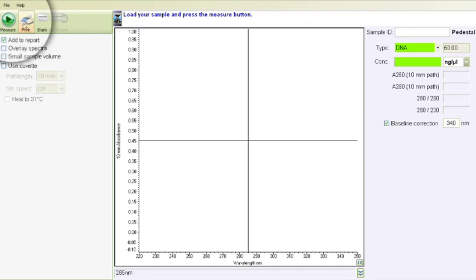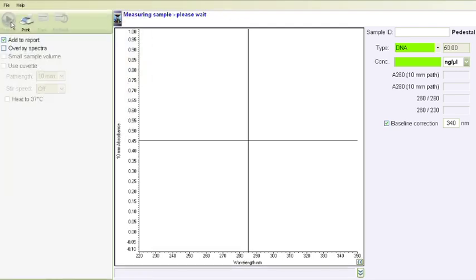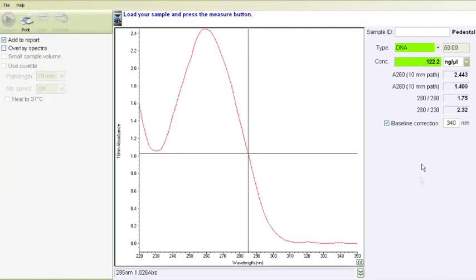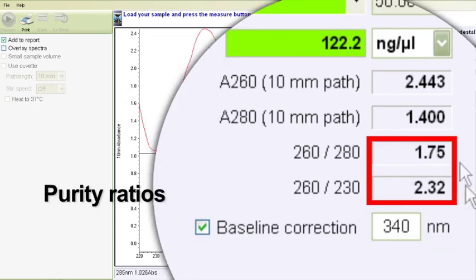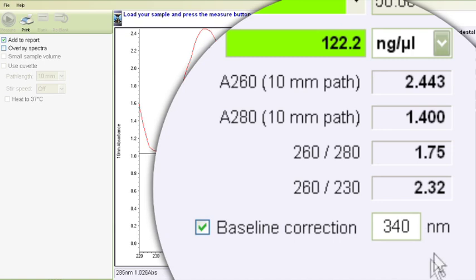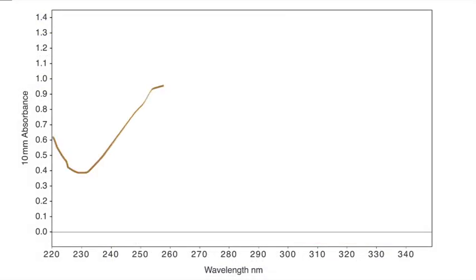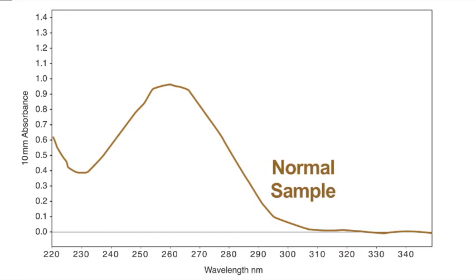Select Measure in the application software. The software will automatically calculate the nucleic acid concentration and purity ratios. Following sample measurement, review the spectral output. A typical nucleic acid sample will have a very characteristic profile.